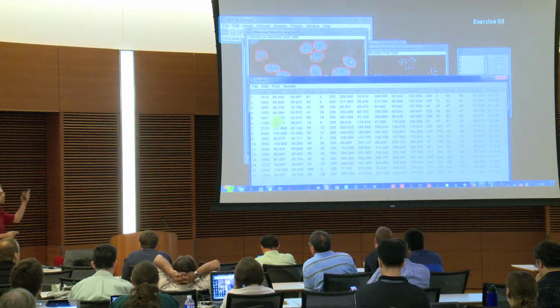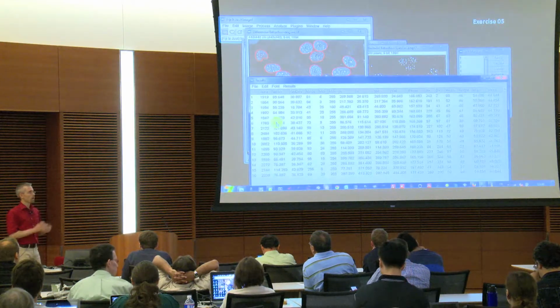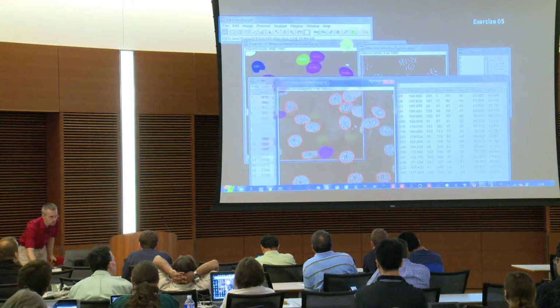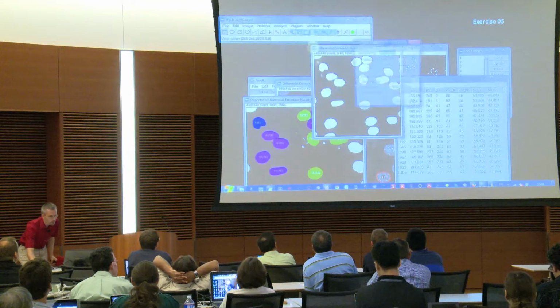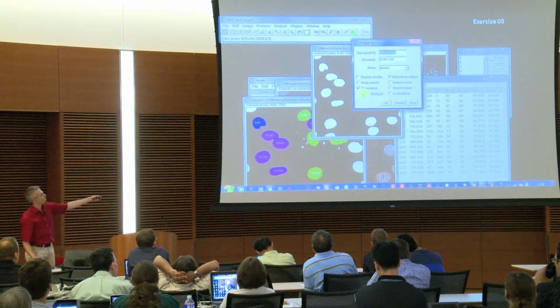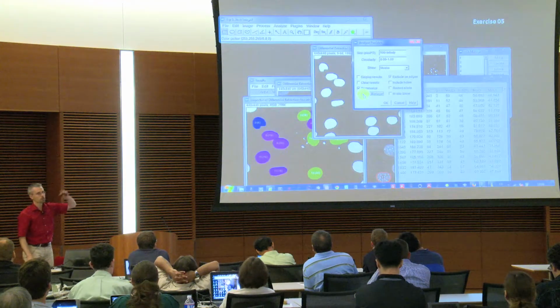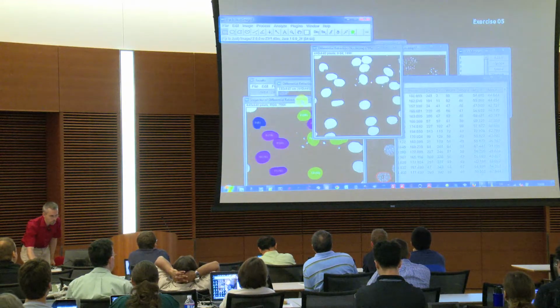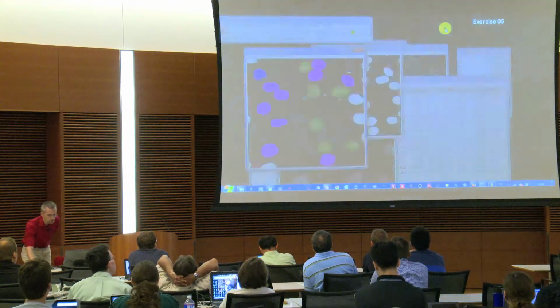You can use either the speckle inspector if you have 2 different image types, or analyze particles on one binary image only. Analyze particles also has this option, add to manager, which would do exactly the same, so it would read in the outlines of all analyzed objects. So much for this differential analysis here.